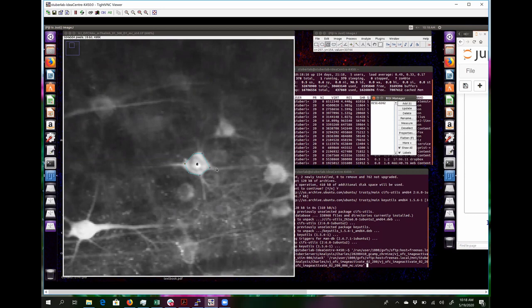Now, there are a couple of issues that I think are problematic here. If you pick this as your ROI, there's a nice feature where you can hide all the ROIs, if you just want to see what it looks like with and without them. That's pretty helpful. Now the ROI is on. Let's say your recording has any motion at all, just any movement on a couple of frames.